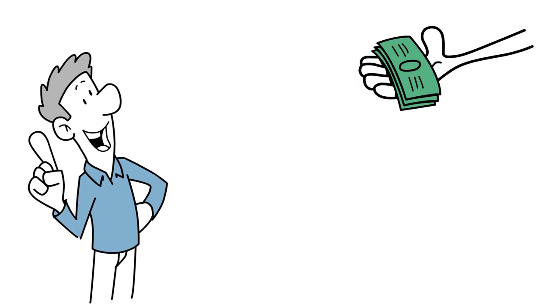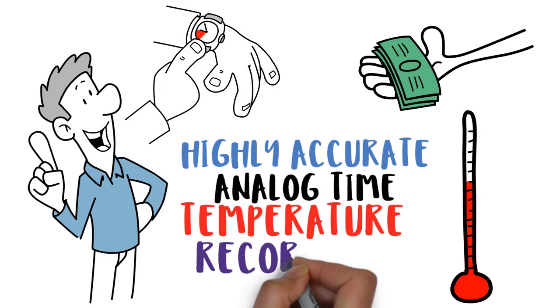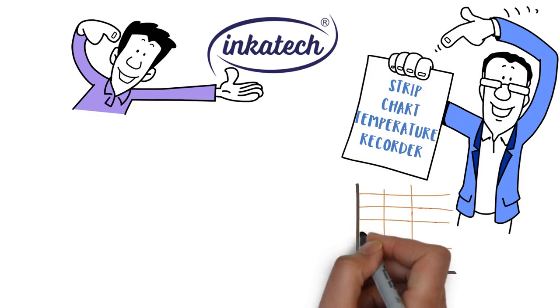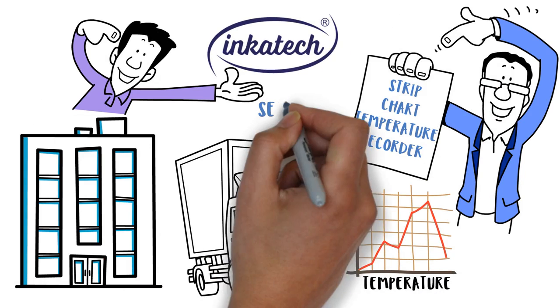Do you want an inexpensive, highly accurate and reliable analog time temperature recorder? Then use the Incatec strip chart temperature recorder. It generates a permanent strip chart record of temperature conditions during storage or transportation of temperature sensitive products.